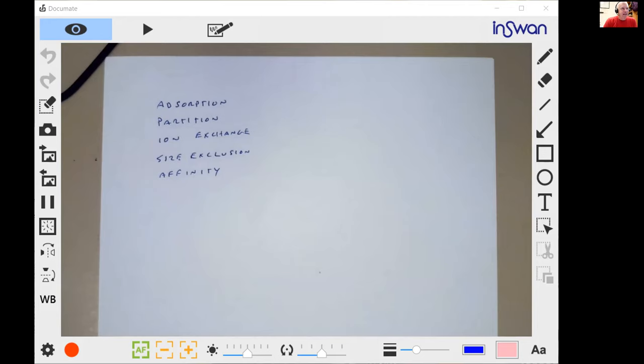Fluorescence is described pretty well in the lab manual. They're all in the lab manual. Sometimes the lab manual asks you to do a little bit too much, and in the case of HPLC, it asks you to do too much. For fluorescence, it has a picture you're supposed to fill in, but I don't really care about that anymore, so you can skip that if you want. You could follow the lab manual, and basically you've got to import.